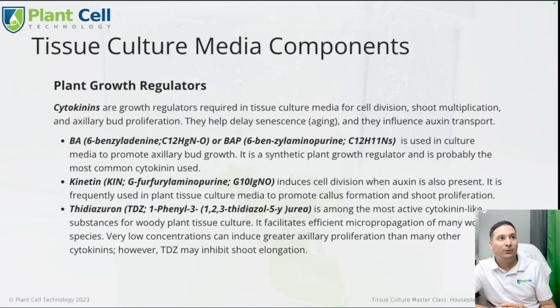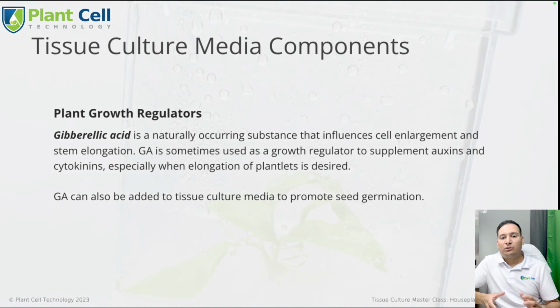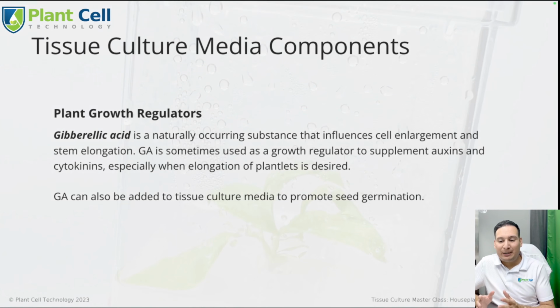However, you have to be careful if you use too much TDZ because it can also inhibit shoot elongation. So again, you get a ton of really small plants, which is not great. All right, so those are kind of the most general plant regulators.